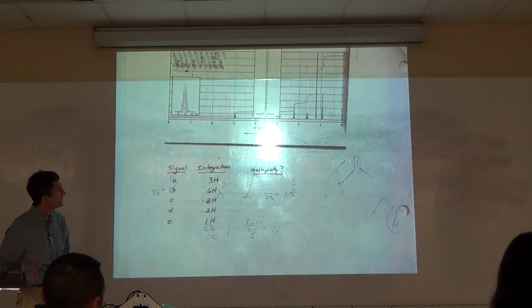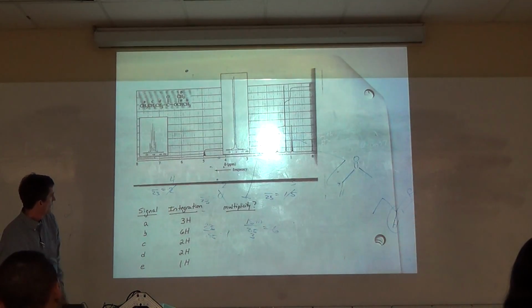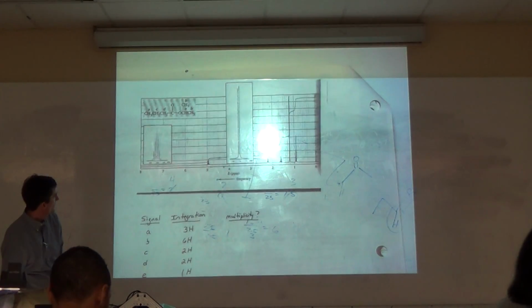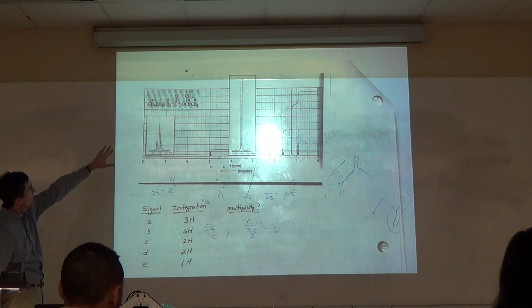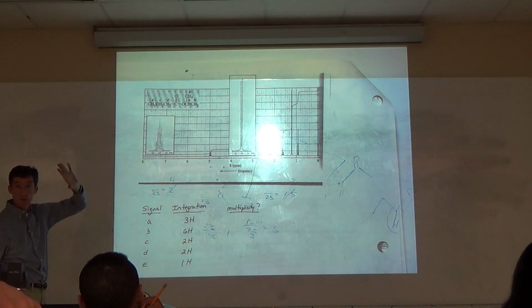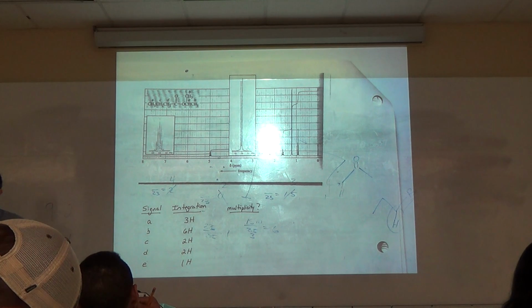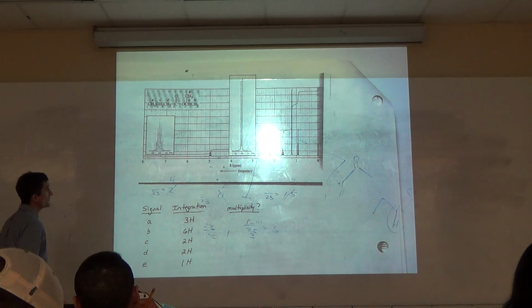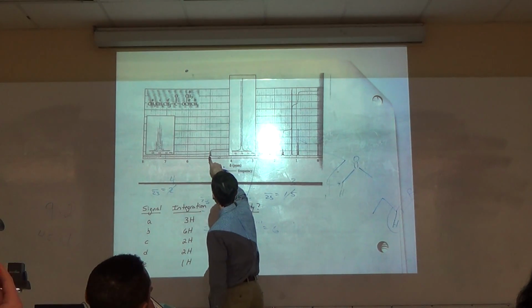Okay. So maybe coming around the home stretch for today. Let's do this here. Here's an NMR of this compound. How many signals? Based on lettering, 5. If I agree the two methyls on the end are the same, they both bind into a CH. 5 signals. Here are your 5. 1, 2, 3, 4, 5.